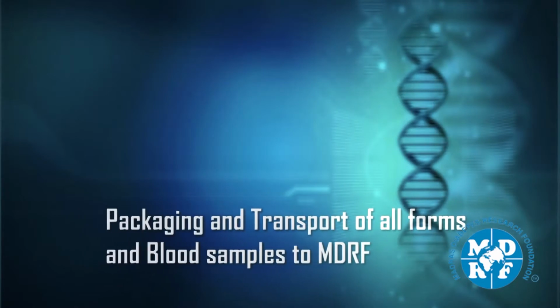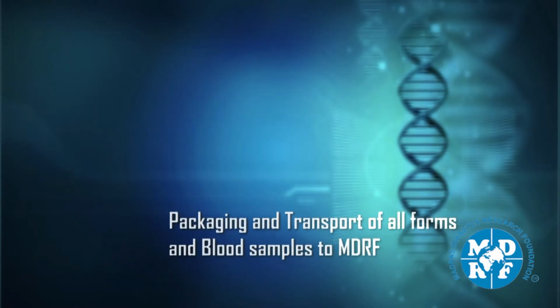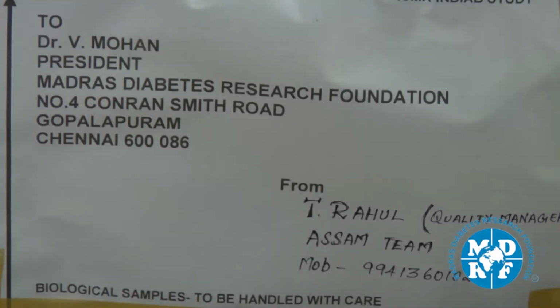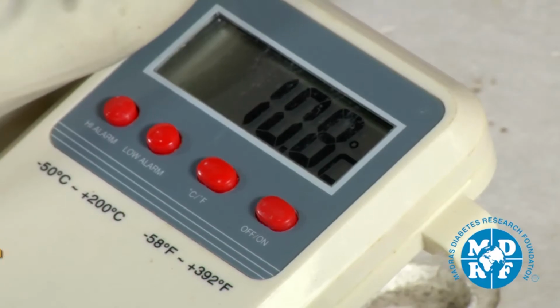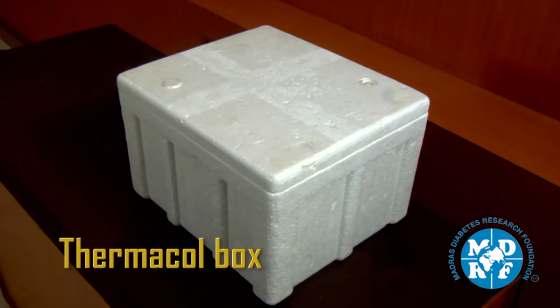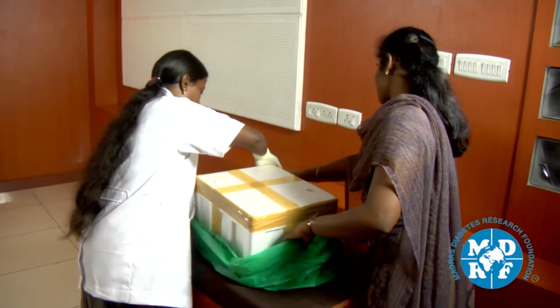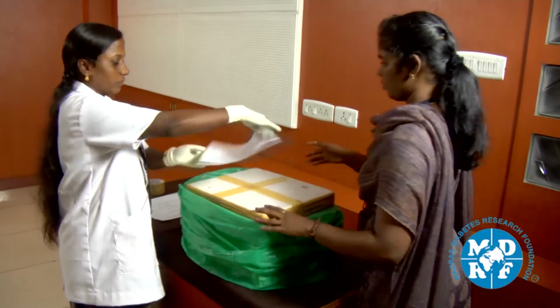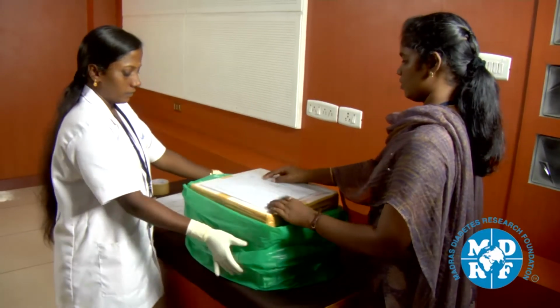Packaging and transport of all forms and blood samples to MDRF. Next, we will deal with the procedure involved in sample packing for shipment. Materials required for packaging are as follows: address label, thermometer, brown tape, thermocol box and dry ice. Prior to transport, the thermocol box needs to be within the labeled packing box and lined with dry ice.